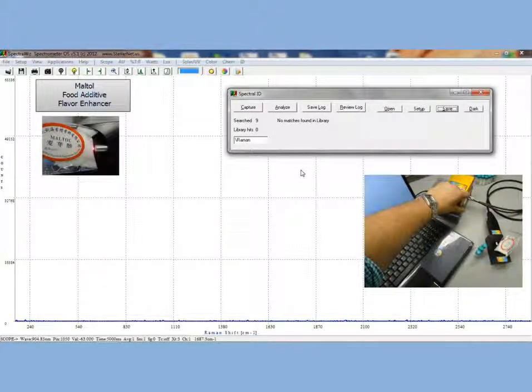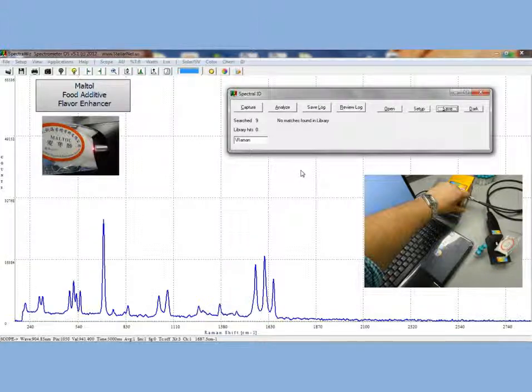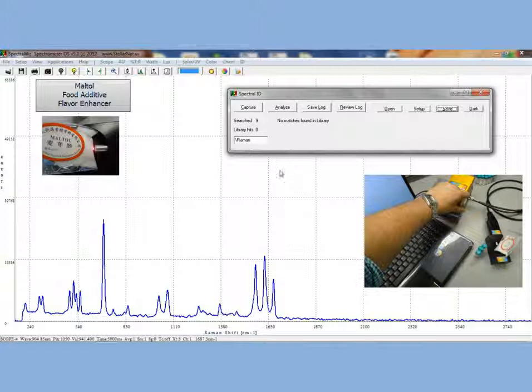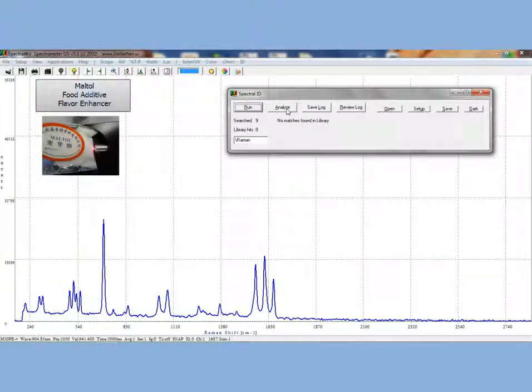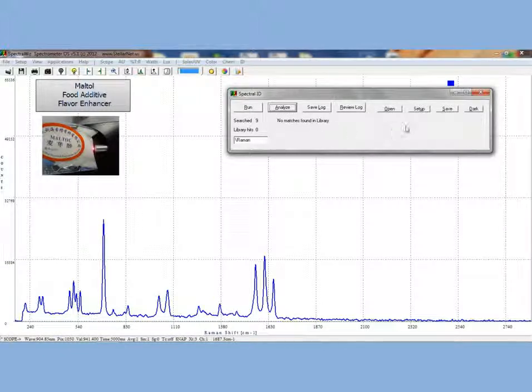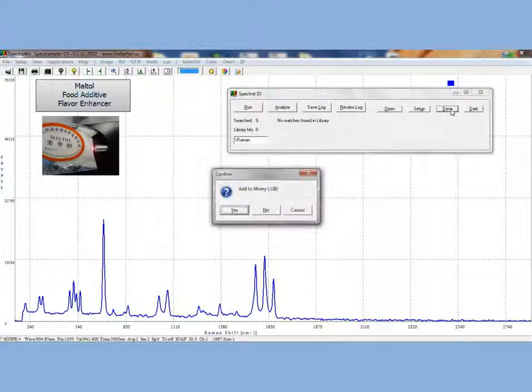For our first measurement, we will measure maltol in a bag. Go ahead and click the red laser activation button on the front of the Raman laser. After acquisition time, you will see the Raman spectra of maltol appear on the screen. Go ahead and click capture and then analyze. Once we click analyze, we see that there are no matches in the library, so we will save the file into the library.